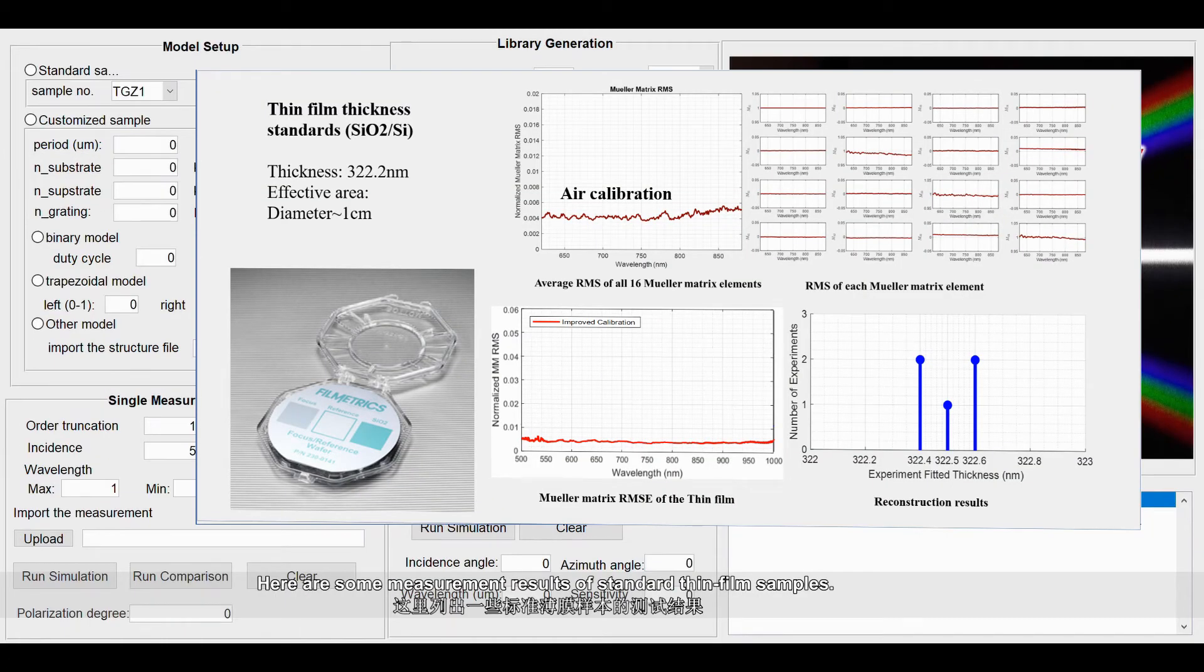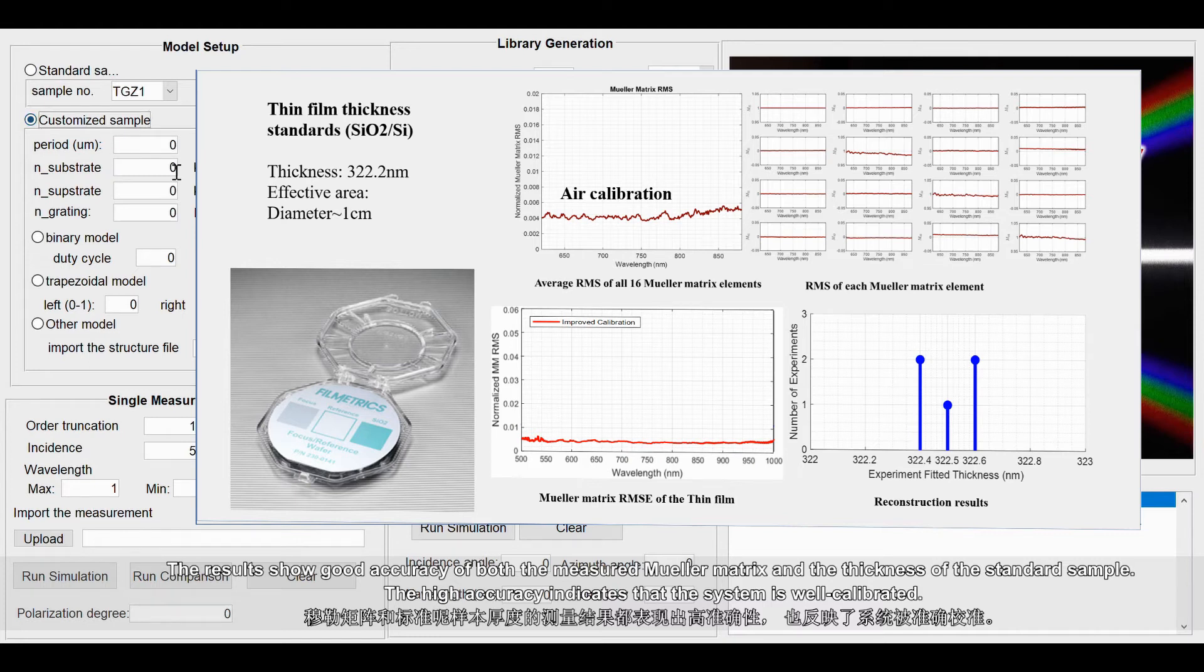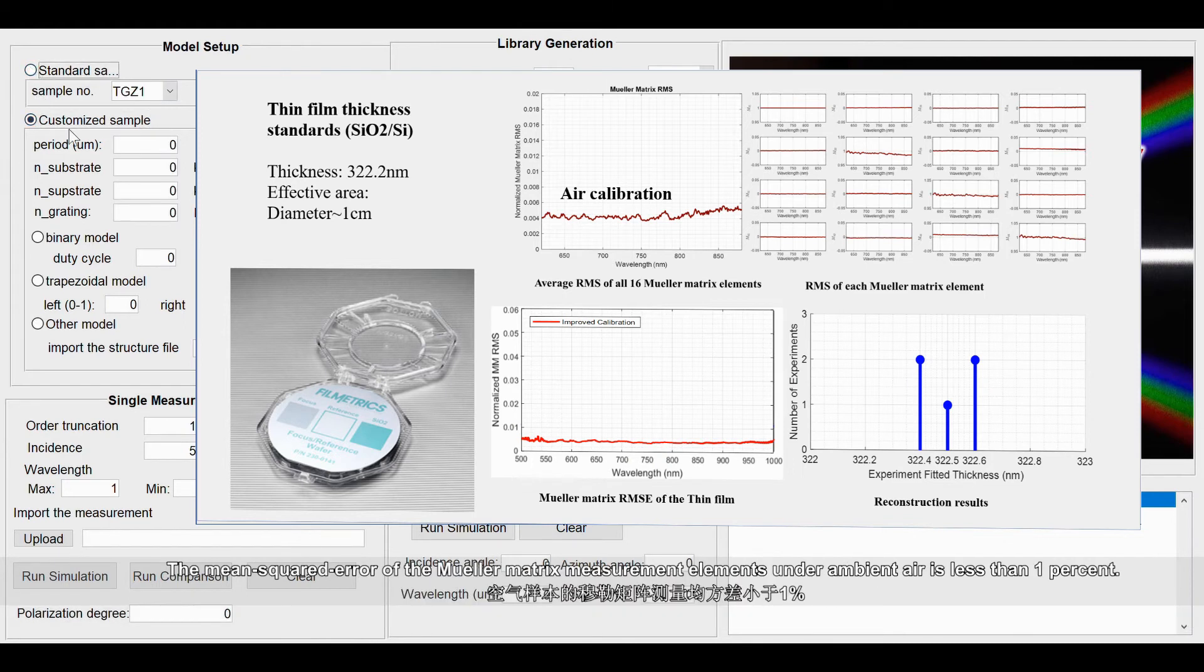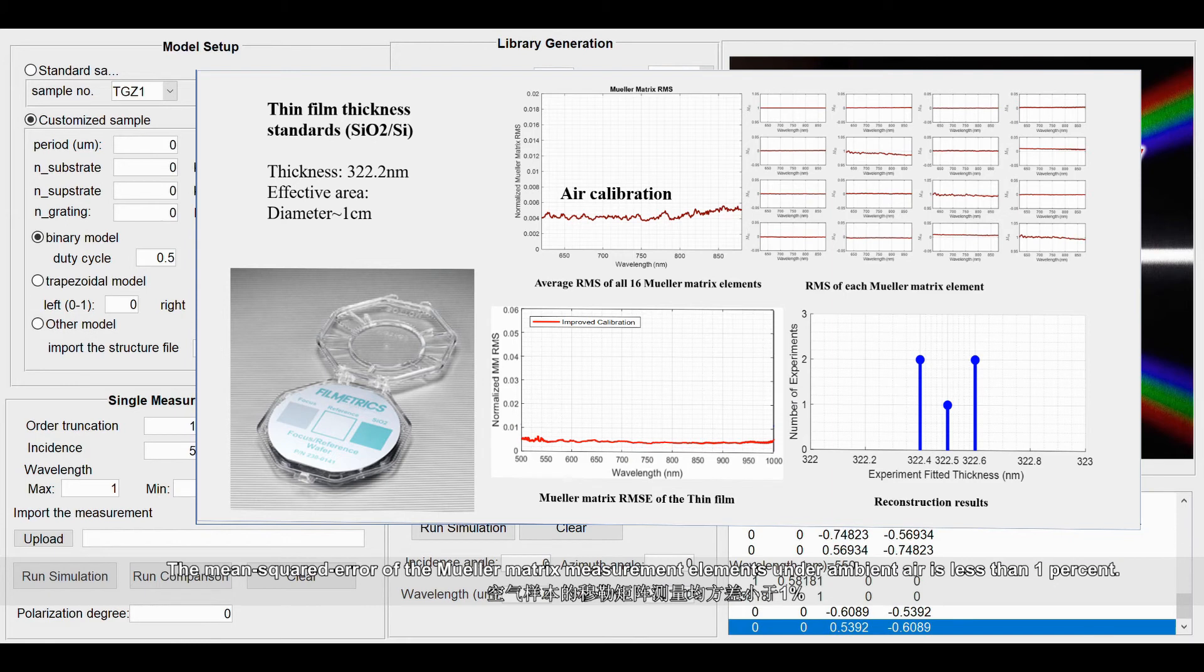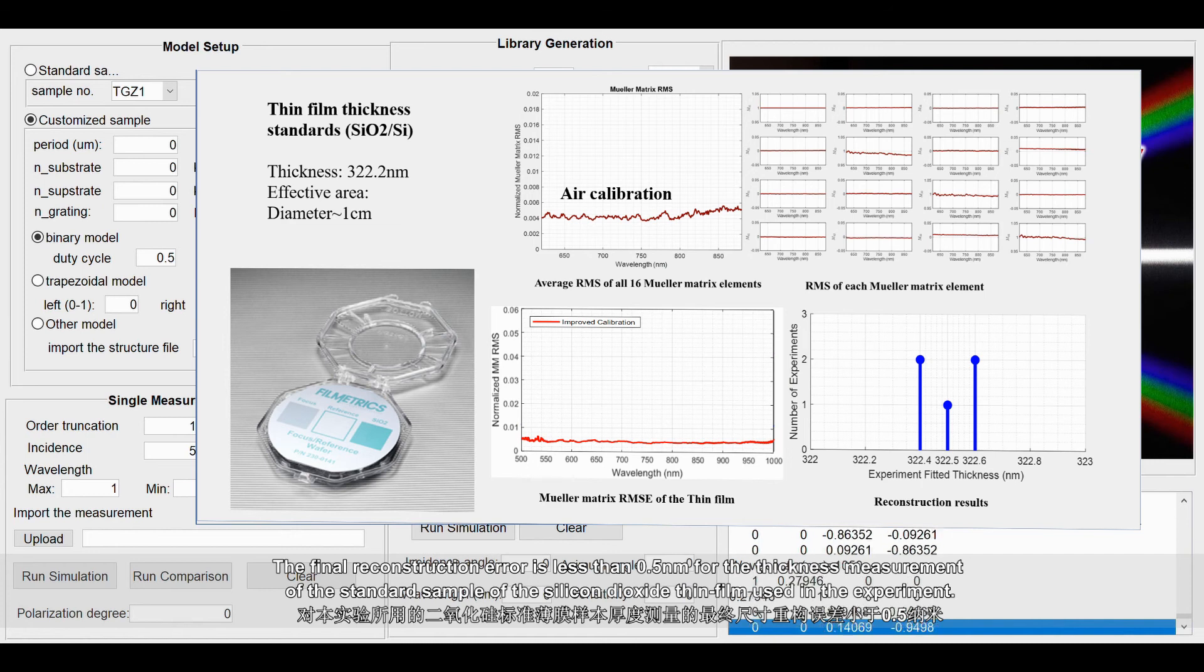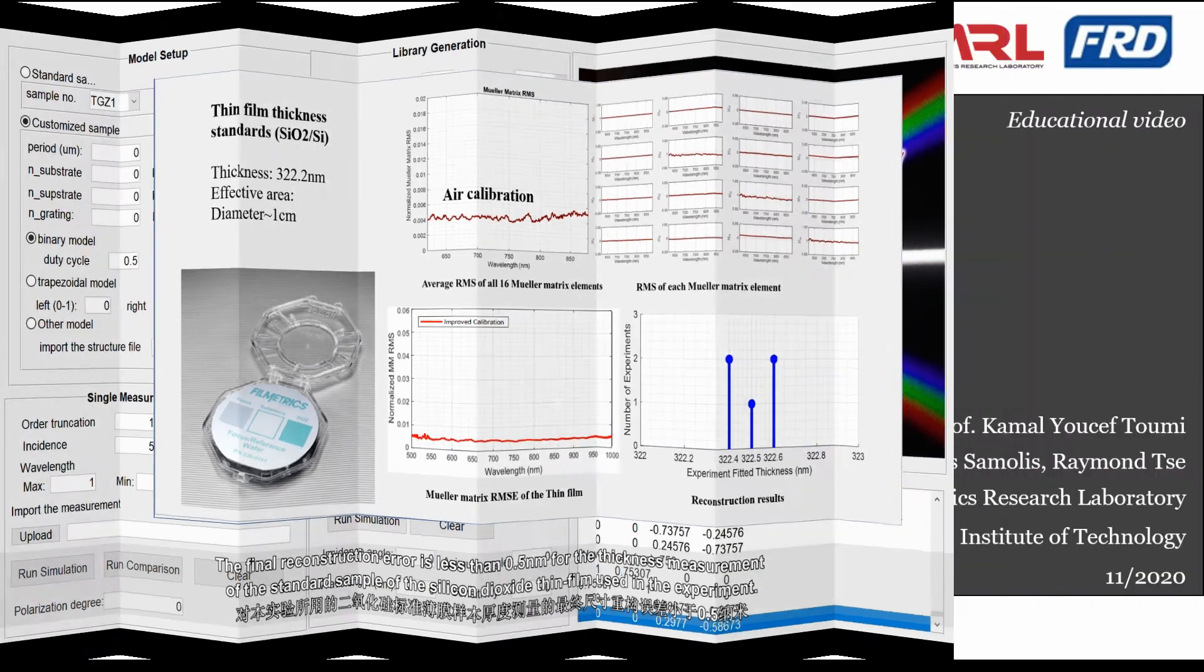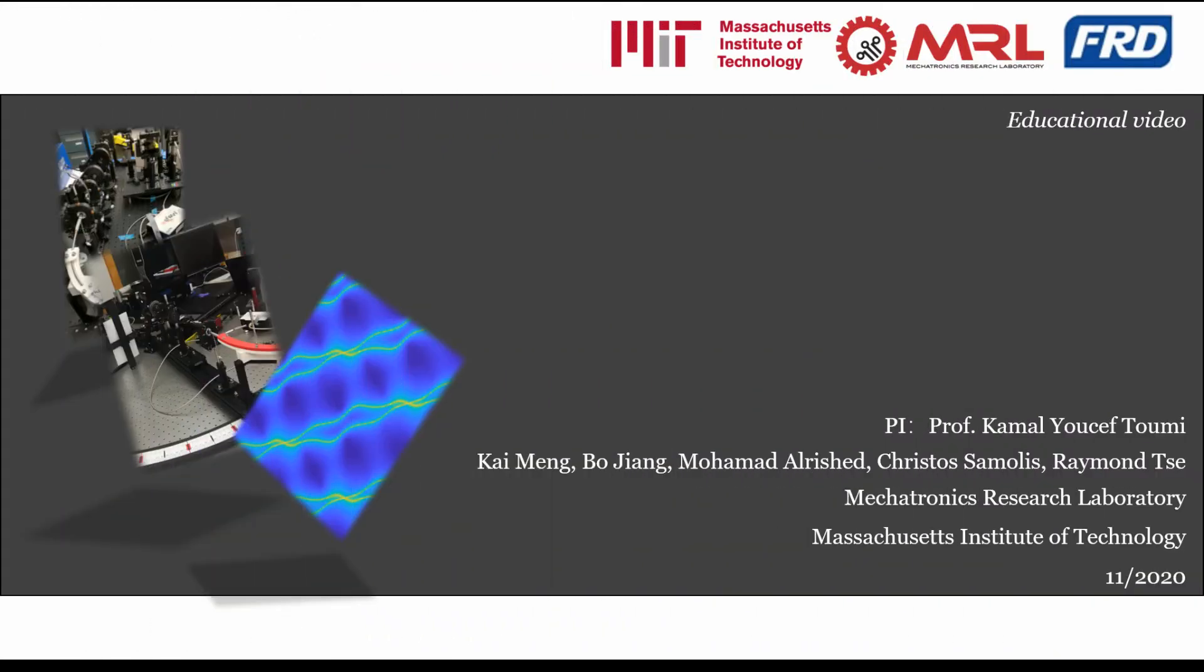Here are some measurement results of standard thin film samples. The results show good accuracy of both the measured Mueller matrix and the thickness of the standard sample. The high accuracy indicates that the system is well calibrated. The mean squared error of the Mueller matrix measurement elements under ambient air is less than 1%. The final reconstruction error is less than 0.5 nanometers for the thickness measurement of the standard sample of the silicon dioxide thin film used in the experiment.